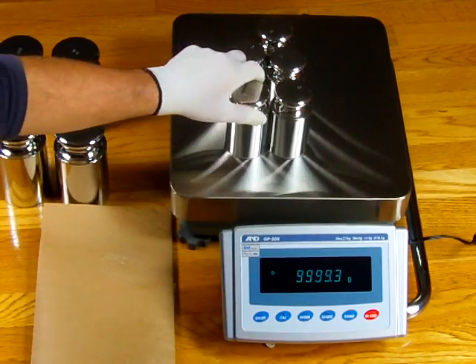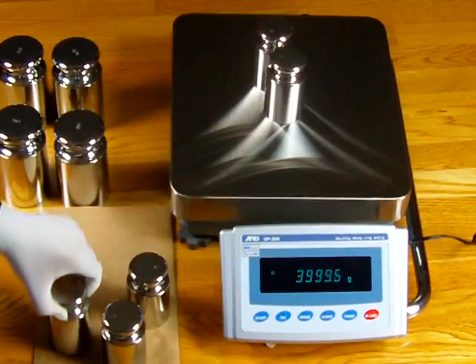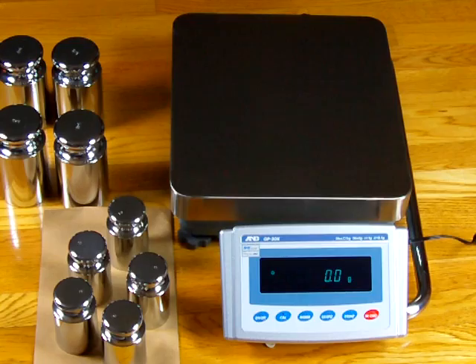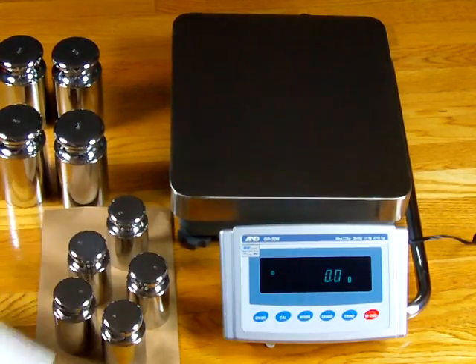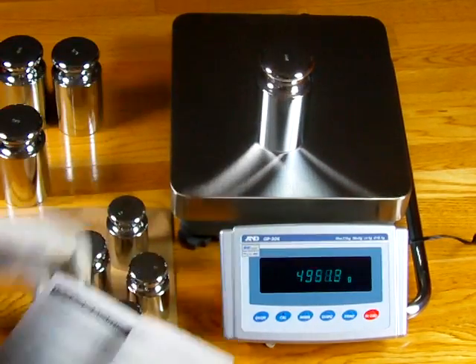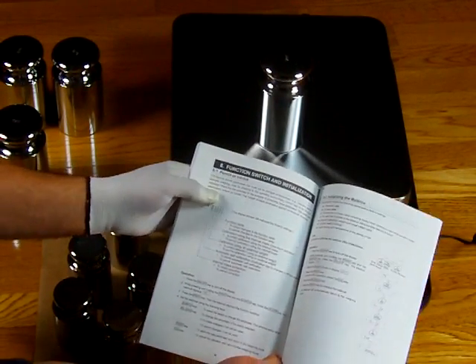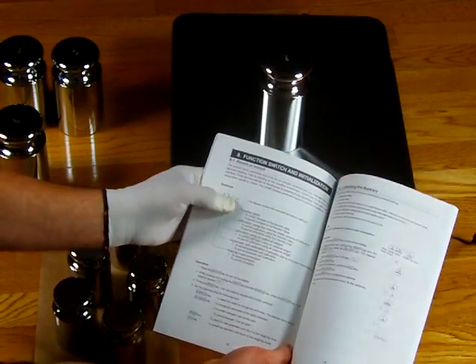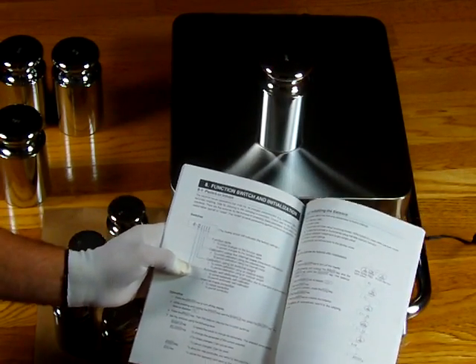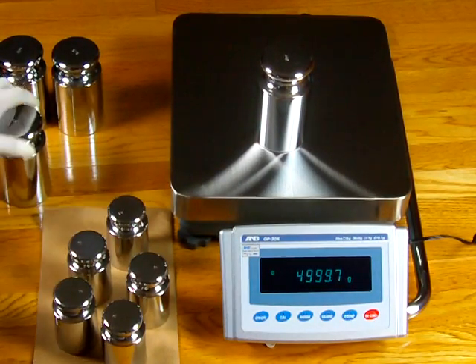The motorized internal calibration does a good job — it's close — but if you really want optimal performance, you want to do an external calibration. And you want to go into the manual and block it so that you cannot do an internal cal, because when you do an internal cal it walks right over it. Right here in the manual on page 34, section 8, it gives you the instructions for blocking the calibration.